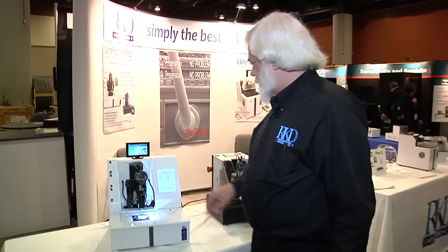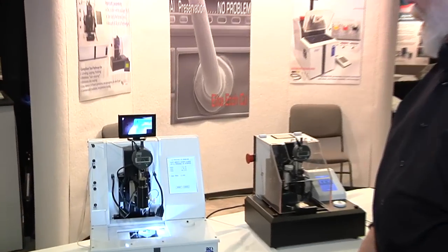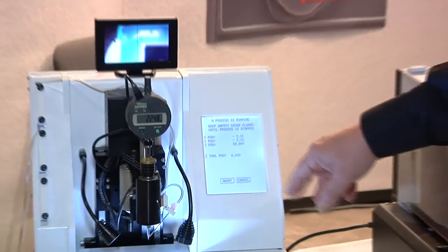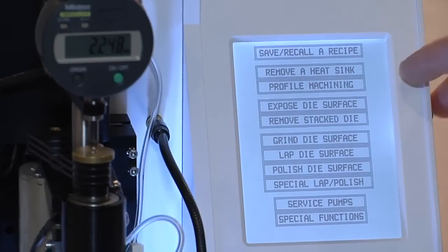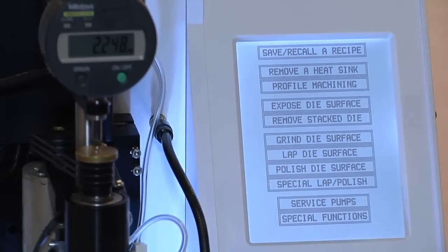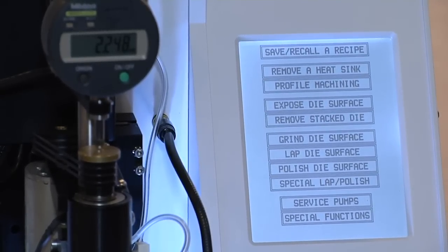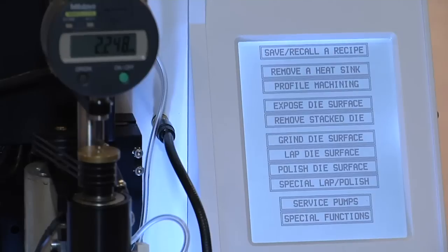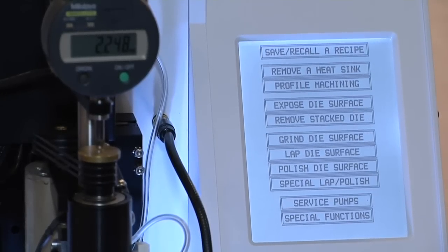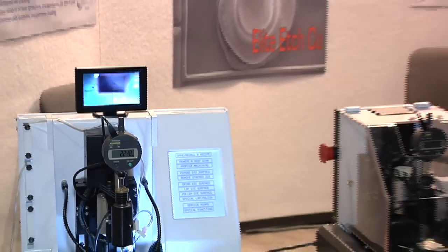The entire thinning process is divided into several steps: grinding, lapping, and polishing. The machine is also capable of removing heat sinks, encapsulant overburden, and die-attach materials to expose a die in preparation for thinning.